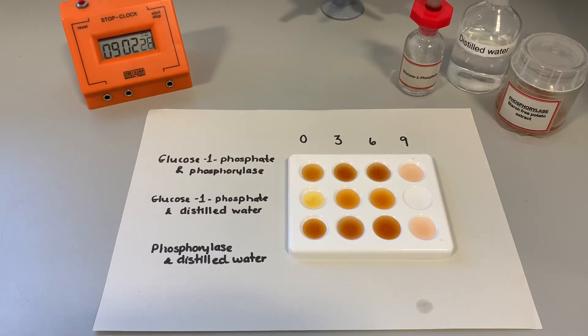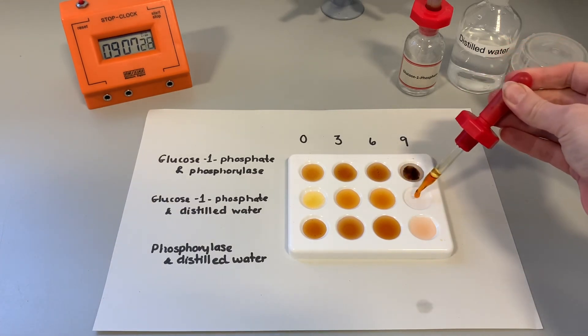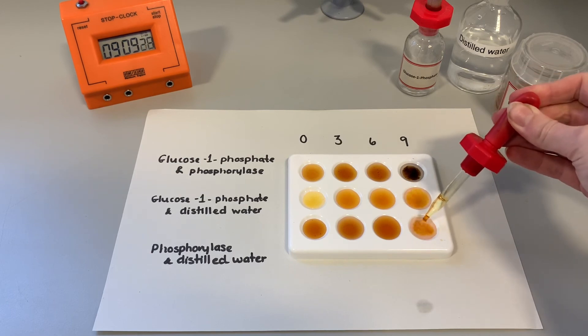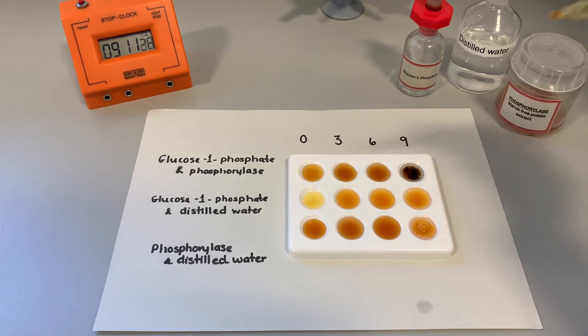Let's have a look at nine minutes and see if we have any starch present. Now you can see there we've got a color change in that top row, which shows that starch has been formed by the action of the enzyme phosphorylase on glucose 1-phosphate.